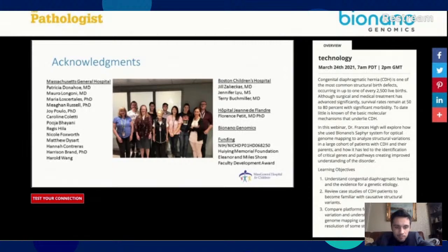Okay, so our first question is, could you use DNA of a non-neoplastic tissue as a reference genome for somatic non-neoplastic changes, i.e. buccal mucosa relative to bone marrow?